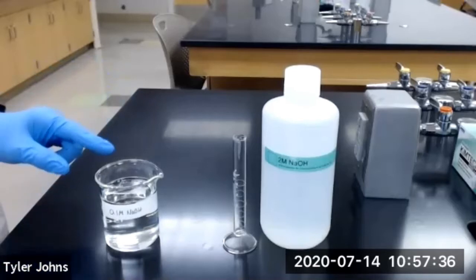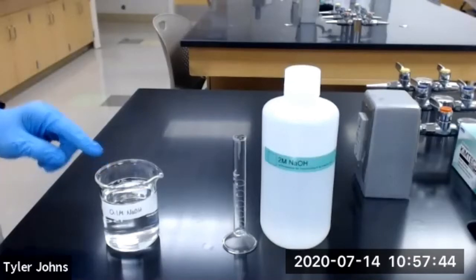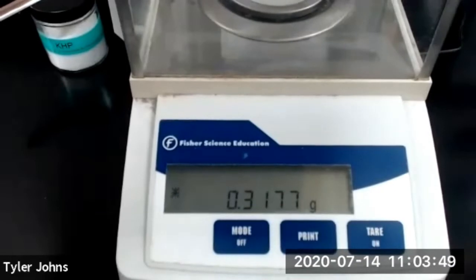We will next standardize our 0.1 molar sodium hydroxide working solution using potassium hydrogen phthalate, or KHP. The mass of KHP for trial number one is 0.3177 grams.